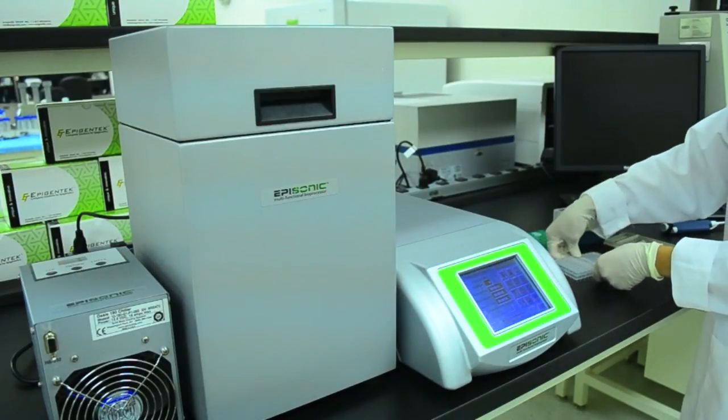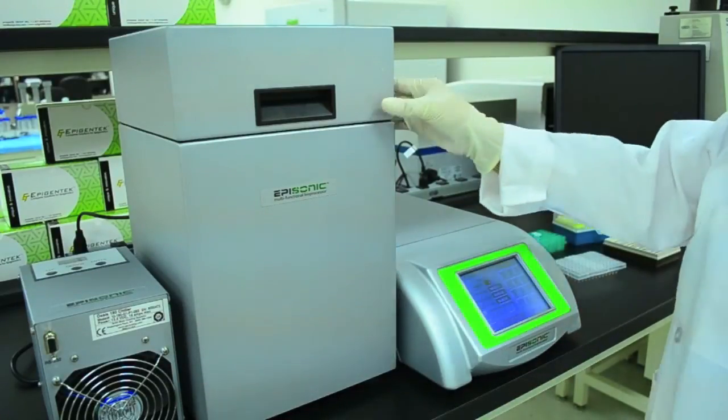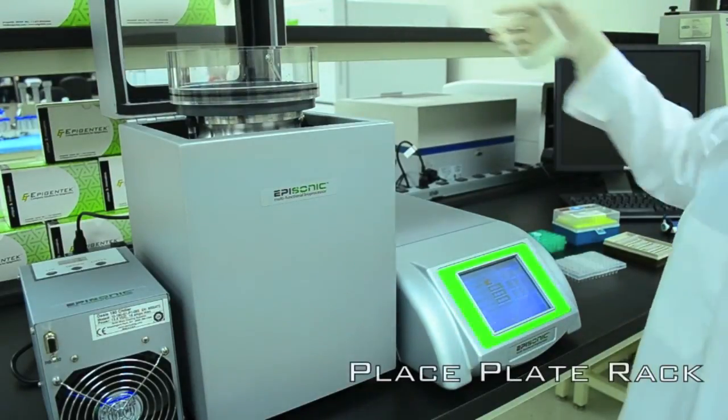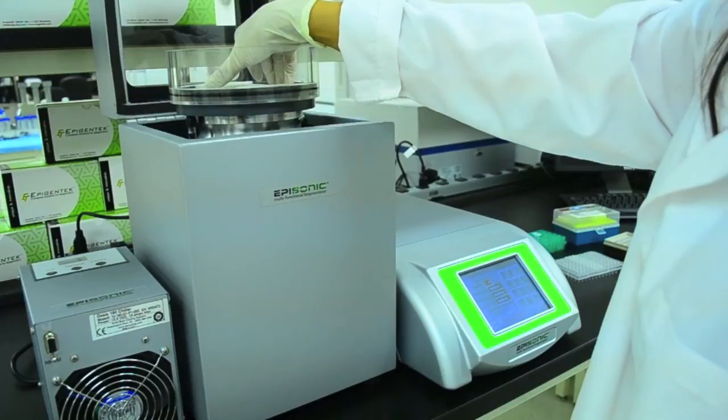Simply load your samples into the wells of the PCR plate, then seal it with either adhesive film or strip caps. Place the plate rack onto the sonication processing horn and then insert the PCR plate.